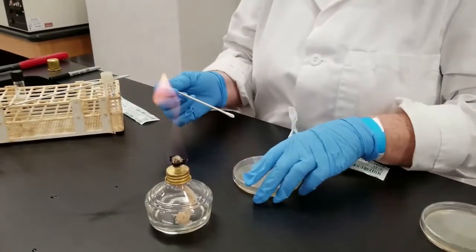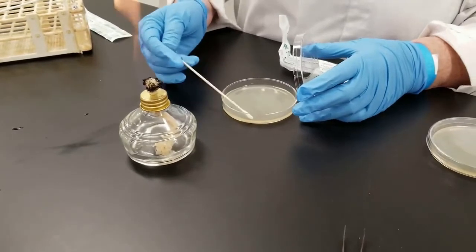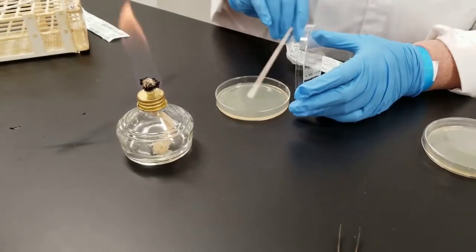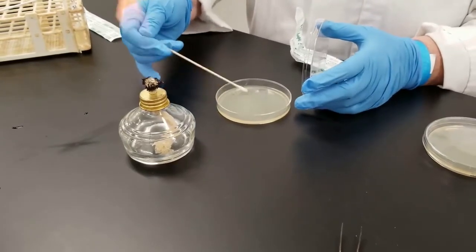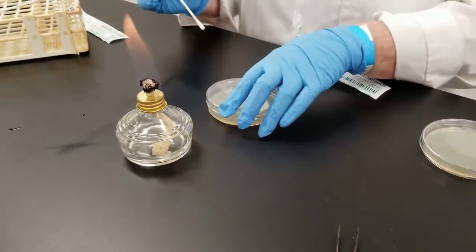And once again on this plate, just like the other one, I want to get a nice, like I say, it's called a lawn. It's just complete solid growth. So you just go in multiple directions. You can turn the plate if you wish. And then around the edge like this.